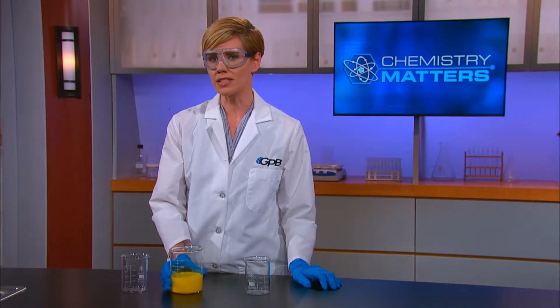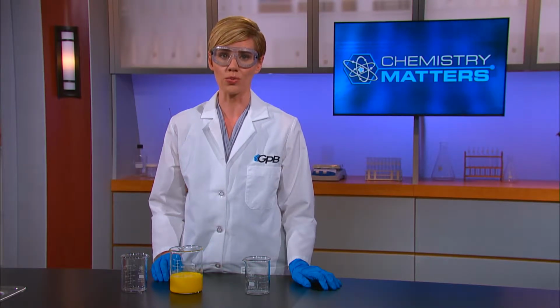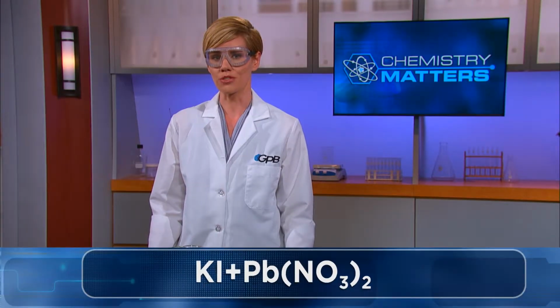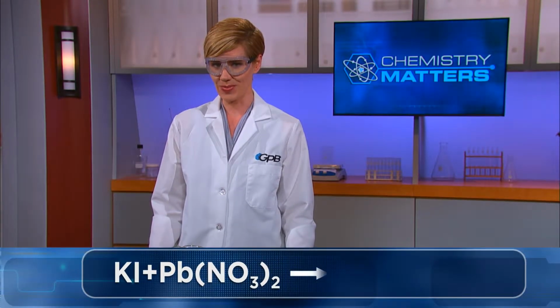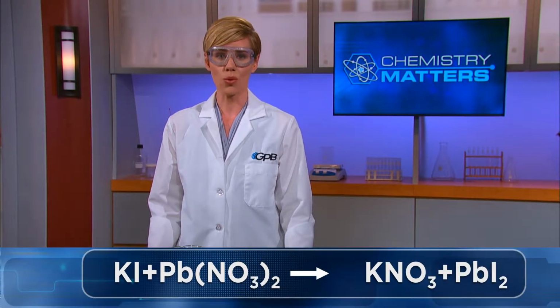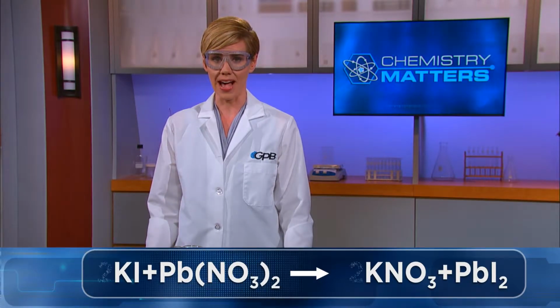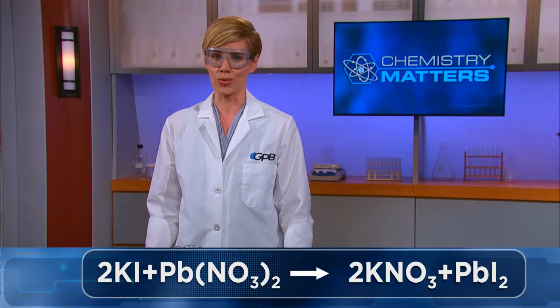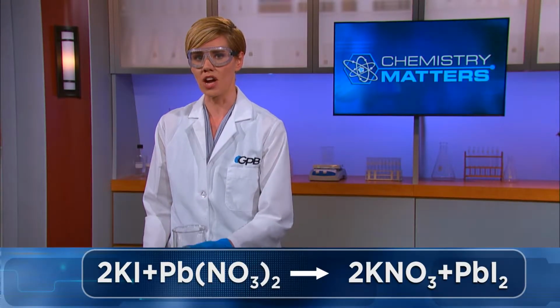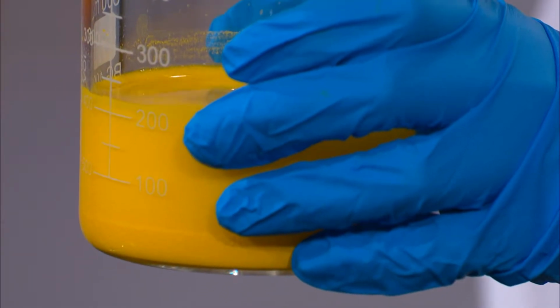Remember, this is a double displacement reaction, so the potassium and lead are going to trade to form the new products. Potassium separates from iodine in water, and lead separates from nitrate in water. When they're mixed together, the potassium will join with the nitrate, while the lead joins with the iodine. Then the equation must be balanced. To balance the equation, place a 2 in front of KI and a 2 in front of KNO3. The solid lead(II) iodide is the yellow solid in our reaction. You can see here that the precipitate is settling to the bottom.